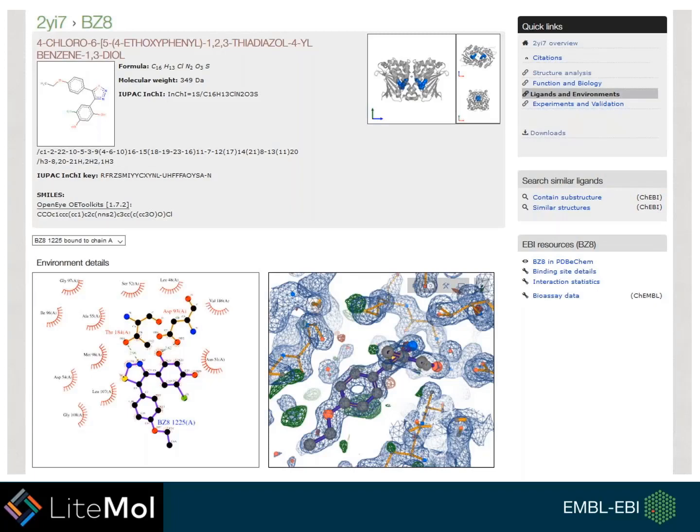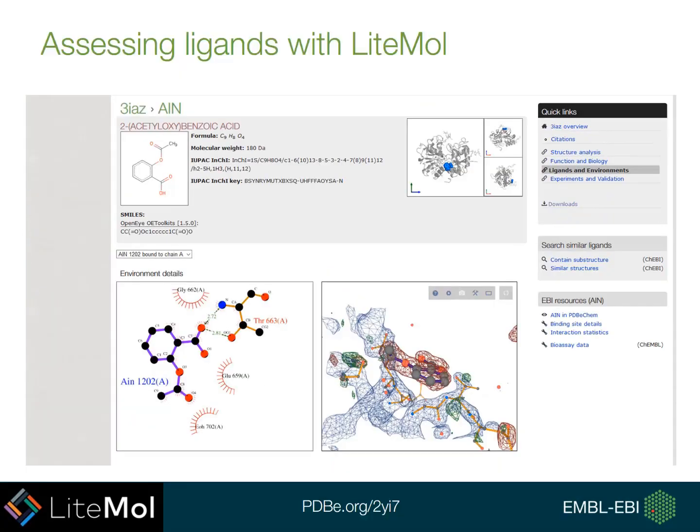If you want to look at a different instance of that same ligand in the structure, there's the option to change this using the box shown here. We also provide two different views of the binding site: a 2D representation on the bottom left, and also in Lightmole with the structure and density shown.